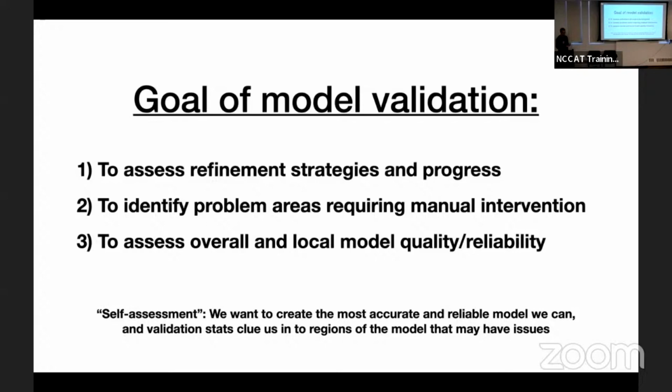Often things like Ramachandran outliers point not just to something incorrect, but will help you identify an area where the backbone geometry is twisted or strained in some way. It might not be easily identifiable based upon the map and fit to the map, but it can draw your attention to an area, and you can then figure out that you have some kind of error in this region, right?